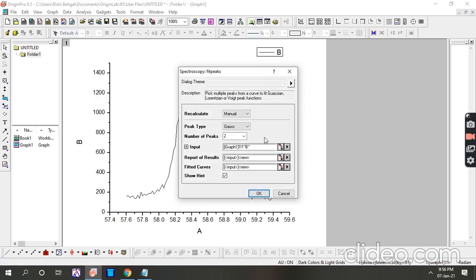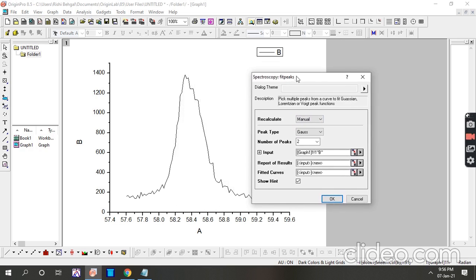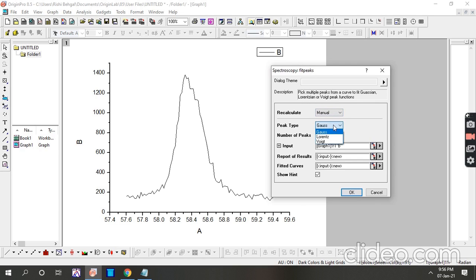You can see the dialog is open. Here we can manually set the parameters to calculate the full width half maxima. This is the peak frame where we can set the peak shape. You can use a Gaussian curve, Lorentzian curve, or Voigt curve. Here we need to write how many peaks we are using. We have no need to change other parameters, so click OK.